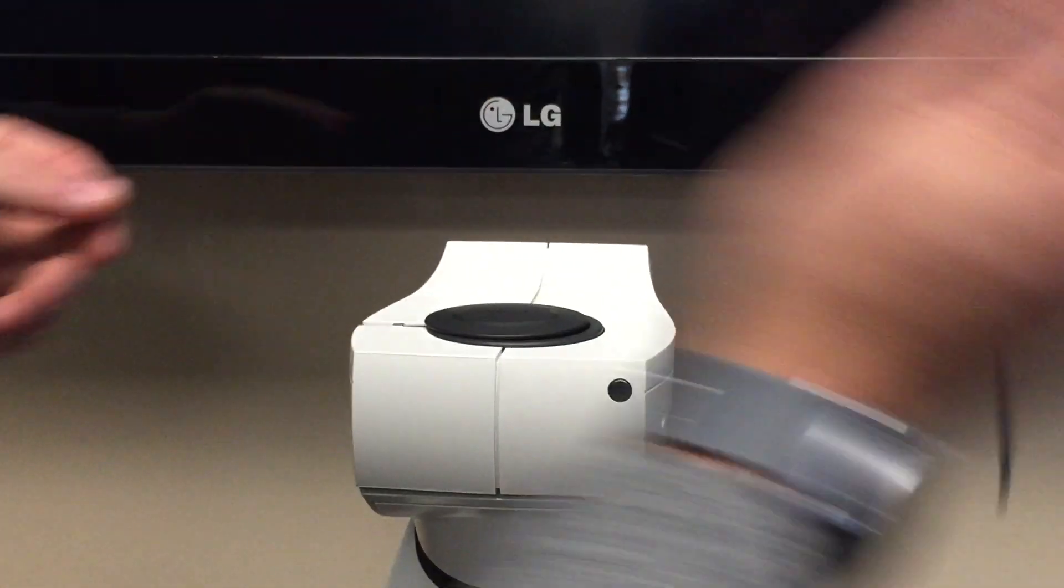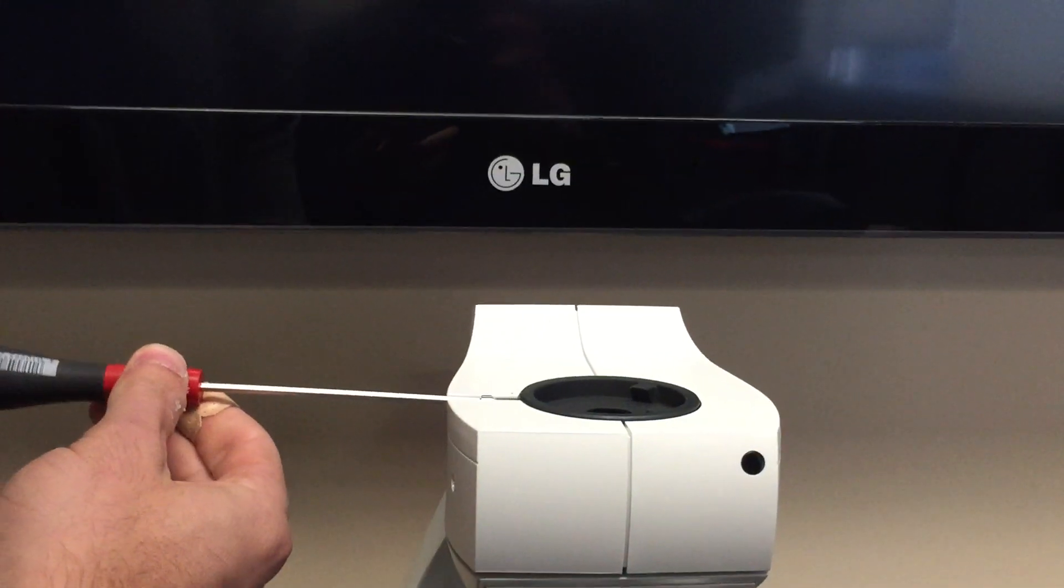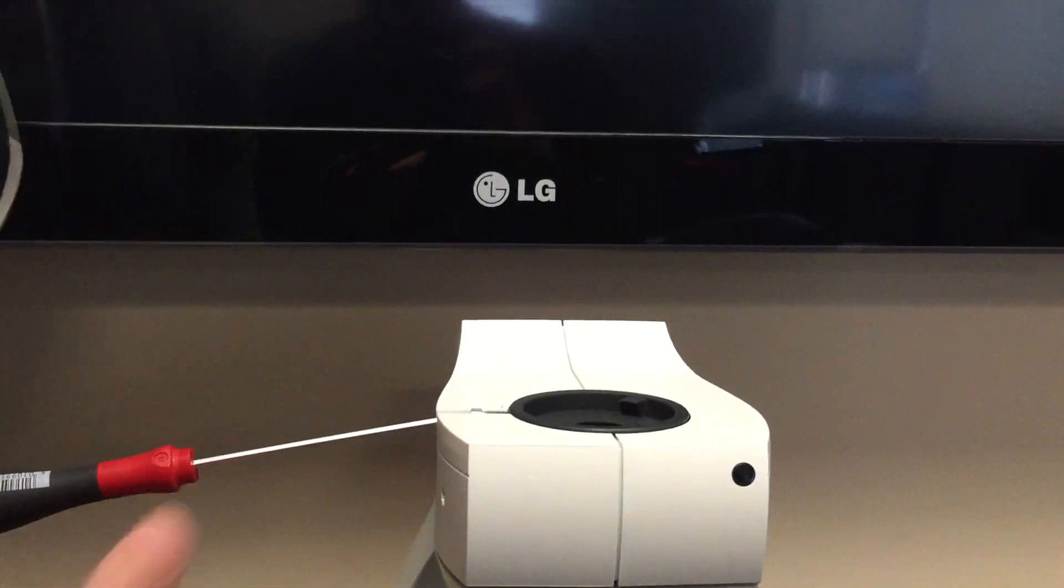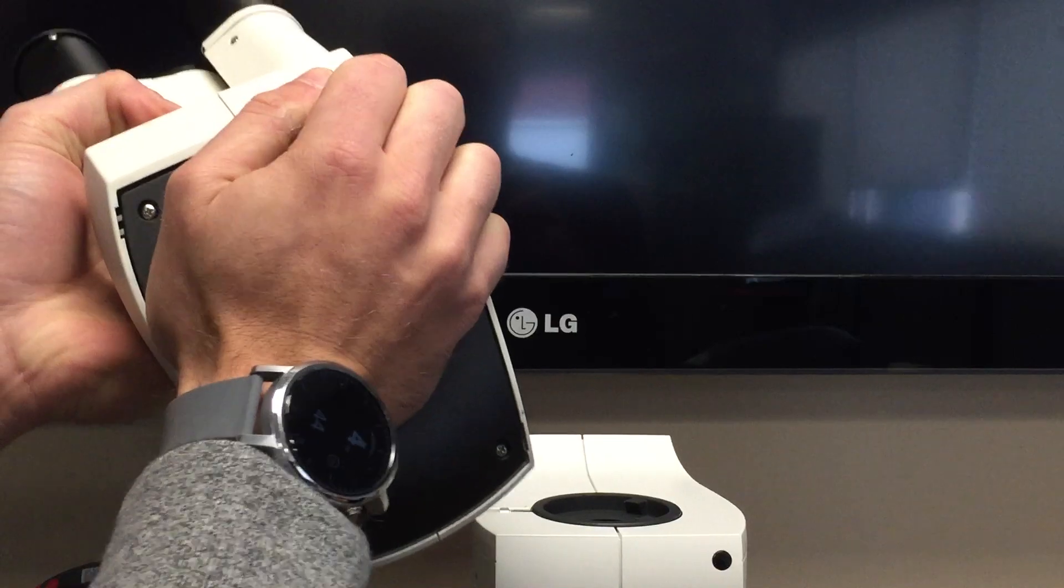From there, you'll do the same thing with the top cap, loosening the screw and removing the cap. You'll then take the viewing head and remove the bottom cap.